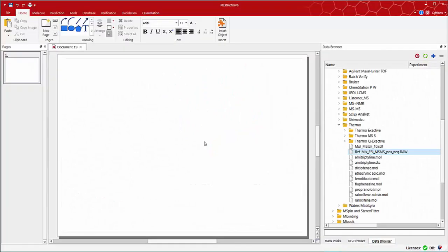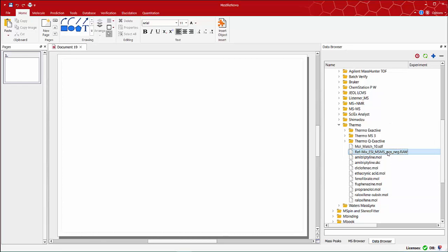Hello everyone. In this session I'm going to show you how to open your MS data, display and visualize the contents with MNOVA MS version 12. First, using the data browser, drag and drop this dataset to the main window.